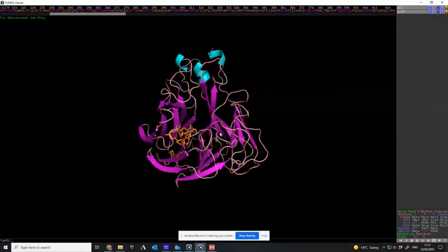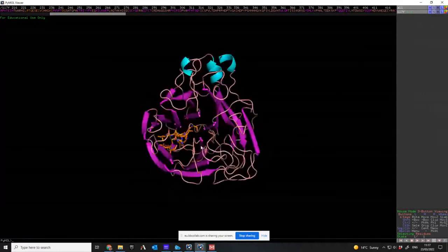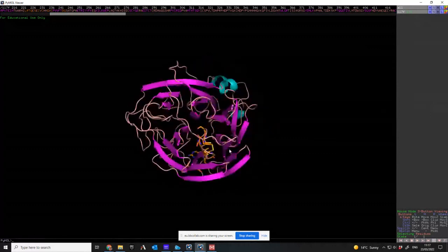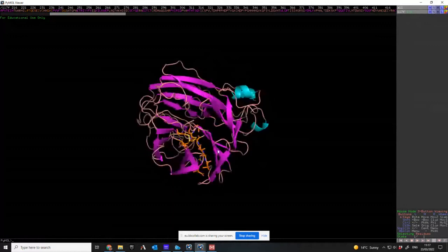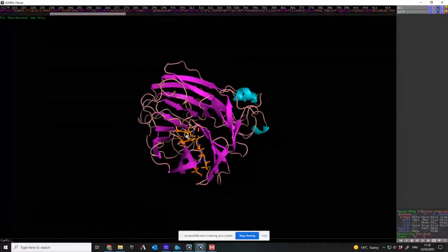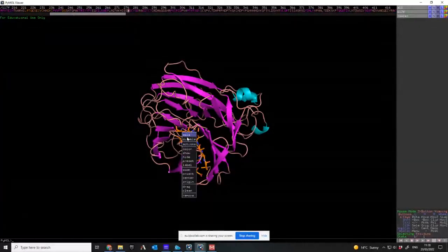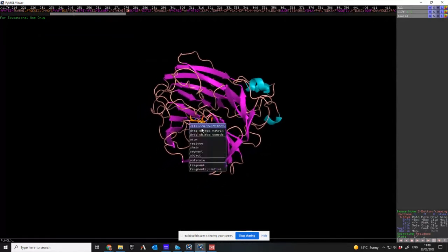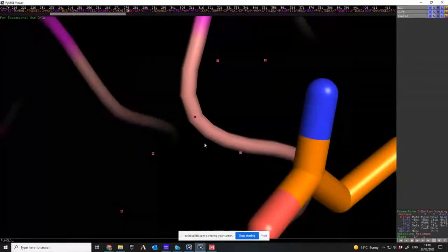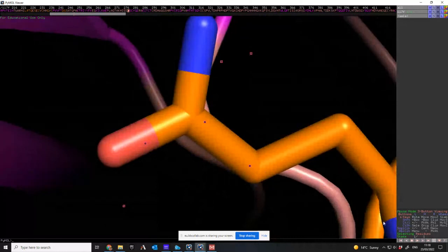So I've deleted the selection. So now I can look at it in detail and say, oh, these are the parts of the protein that are always conserved. So what do I think they're doing? Now, something that's interesting here, which I should select and try and zoom on that one. So center on that particular thing. And then I want to also zoom. Zoom, not so much. Can I less zoom? That's a bit of over zoom.